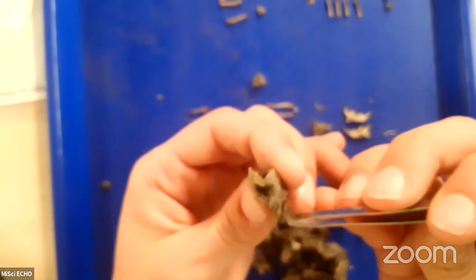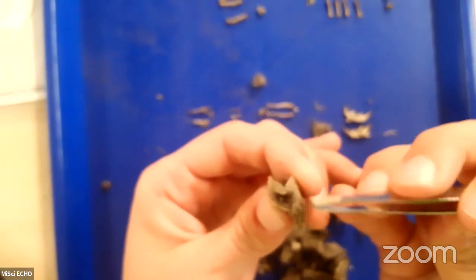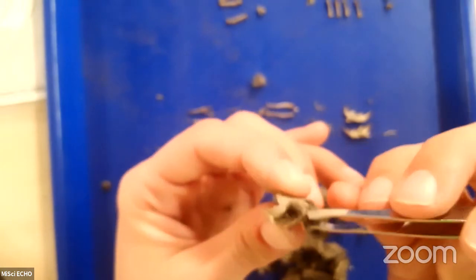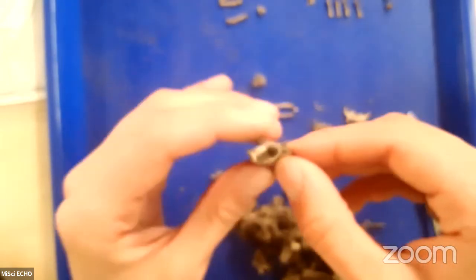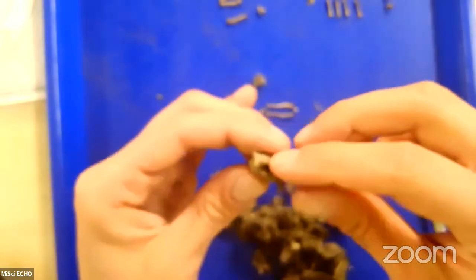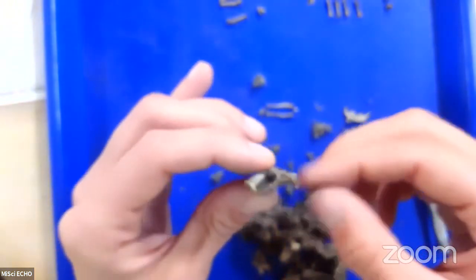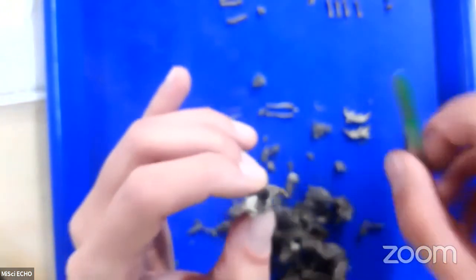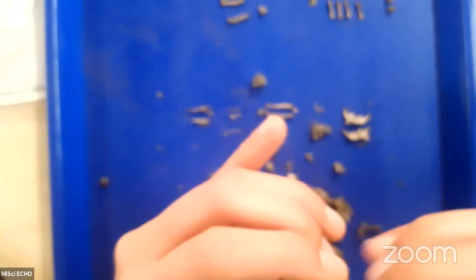All right, so we can get a pretty good look at it now that I've picked away most of the fur. So let's compare this skull, if we can see, to our chart. Sometimes the easiest way is to just very gently pinch off the rest of this fur if your tweezers weren't doing a great job, because tweezers, mine at least, are made of metal, which can be very damaging if you're not careful when using them.